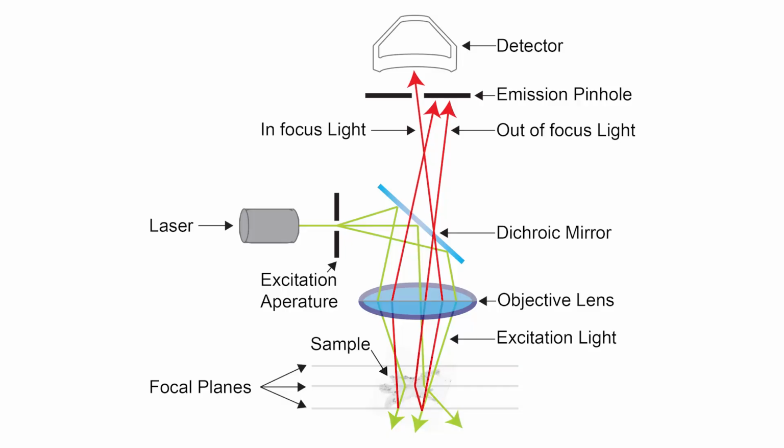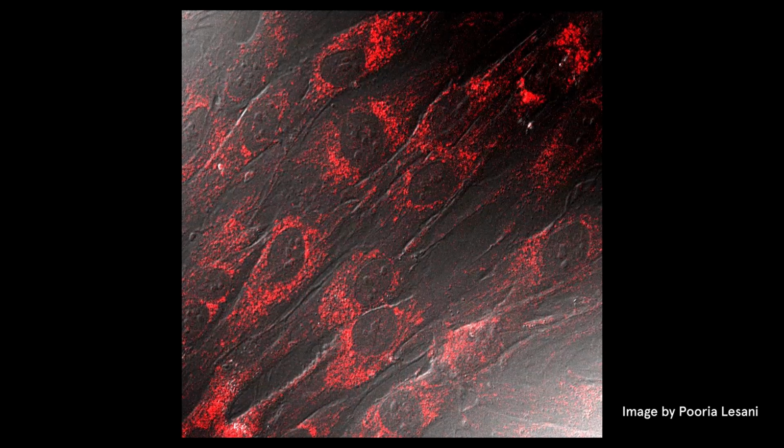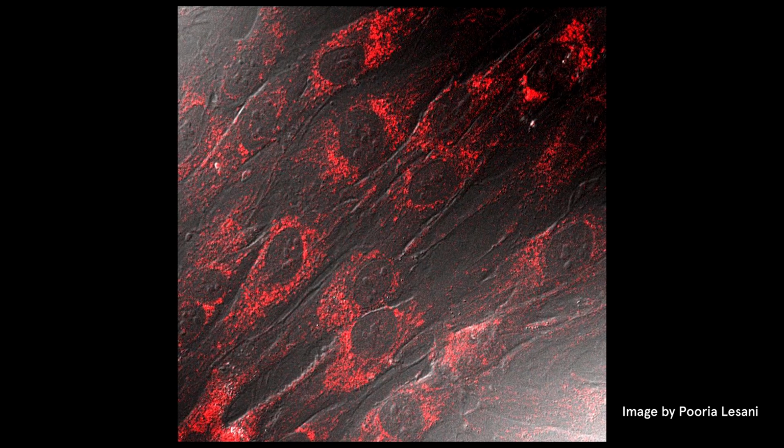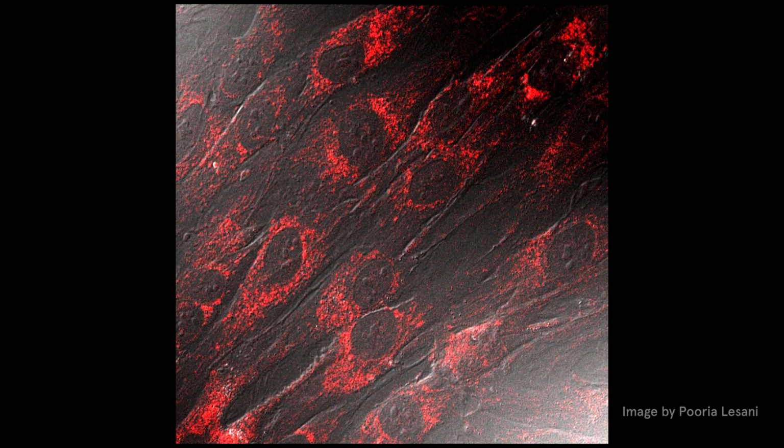Confocal microscopy is an optical imaging technique that provides very high spatial resolution and contrast compared with conventional wide-field optical microscopy, with additional advantages such as control over field depth, minimal background signature, and the ability to collect serial optical sections from thick specimens. For example, here you can see the beautiful fibroblast skin cells that I have captured using a fluorescence confocal microscope.